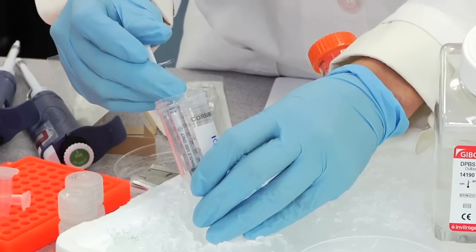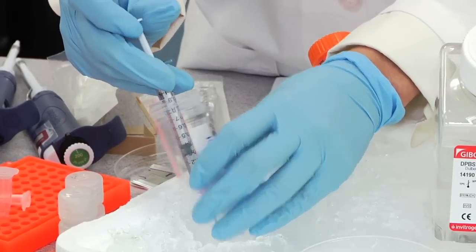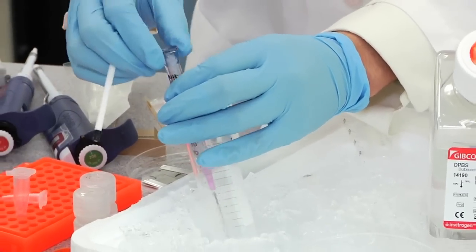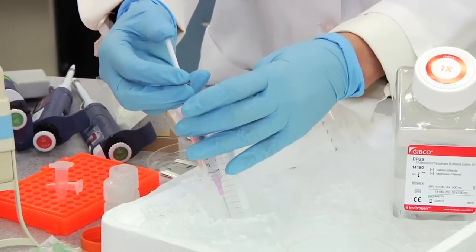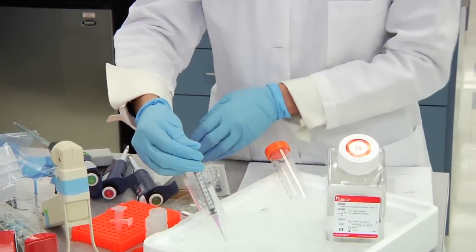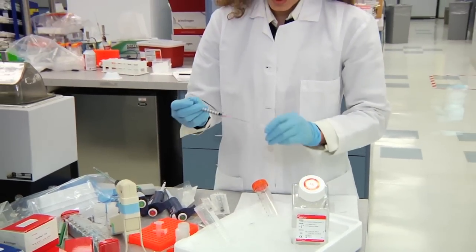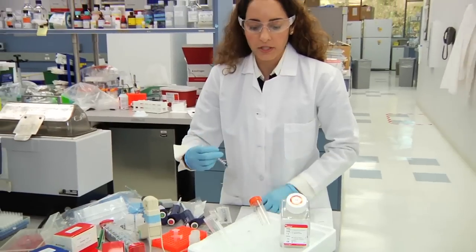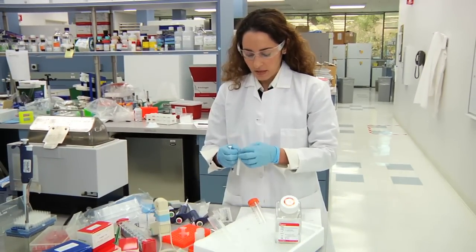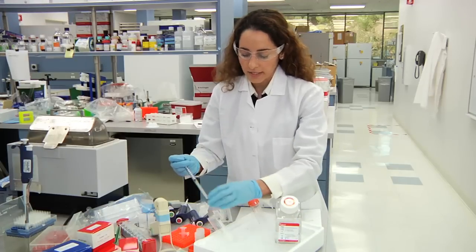It will go easier as you go along. If you happen to get a clog, all you do is remove it and then expel it back through. Once you've homogenized 10 times using the 18 gauge needle, quickly move to your 21 gauge needle and with this needle you're going to homogenize and pipette up and down 20 times.